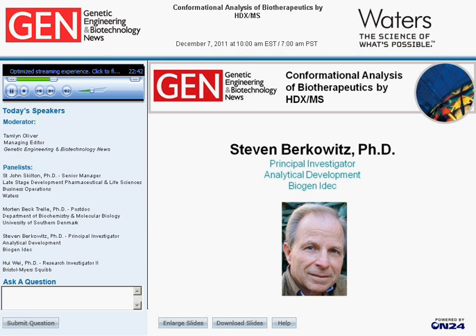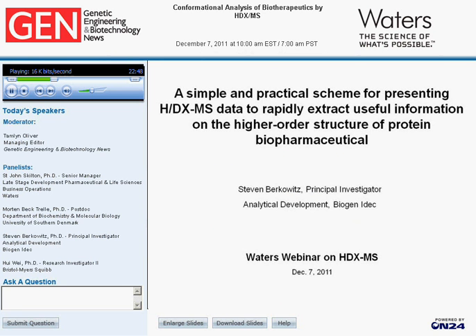Today I'm going to be talking to you about a simple and practical scheme for presenting all the HDX mass spec data that one can actually acquire from these experiments. I'm hoping that previous speakers have laid the foundation for you to understand what is actually involved in doing these experiments, and we'll be extracting higher order information from the protein structure of these biopharmaceuticals. But one of the problems is actually looking at all this data, and that can be a problem. Today, though, we'll be looking at interferon as a model for this.